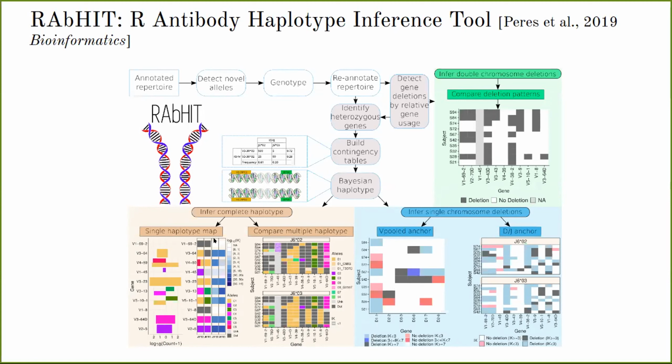Here we also used what Tiger started with Bayesian inference. We used it also here. We did a haplotype based on Bayesian inference. Now this left panel represents the count that we have from each gene recombined, in this example for J6. The middle panel shows the inference we have, the decision of the inference of the allele for each chromosome, and the right panel shows the confidence level.